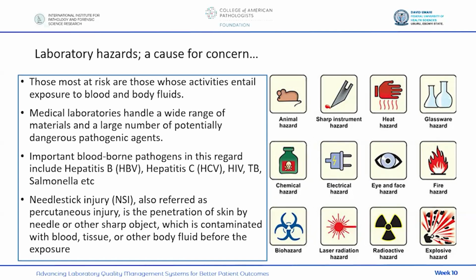So on a daily basis, we are exposed to these bloodborne pathogens. And for that reason, we need to be careful in our work. And then we also talk about needle stick injury, also referred to as percutaneous injury. And this is the penetration of skin by needle or other sharp objects.